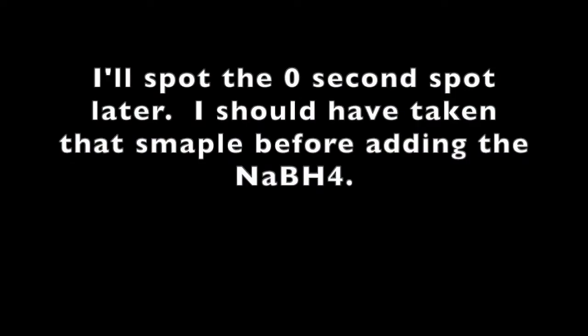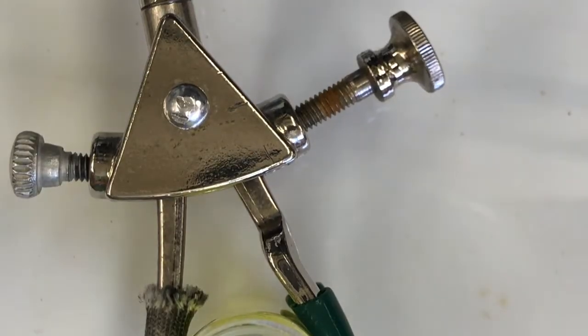At 10 seconds. Boom, that was actually 33 seconds. I'm going to have to adjust my thing. Yeah, this was not as easy as I thought to do alone, but that's okay.